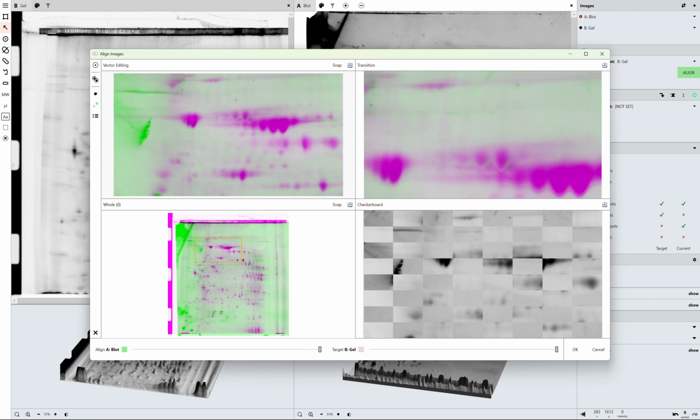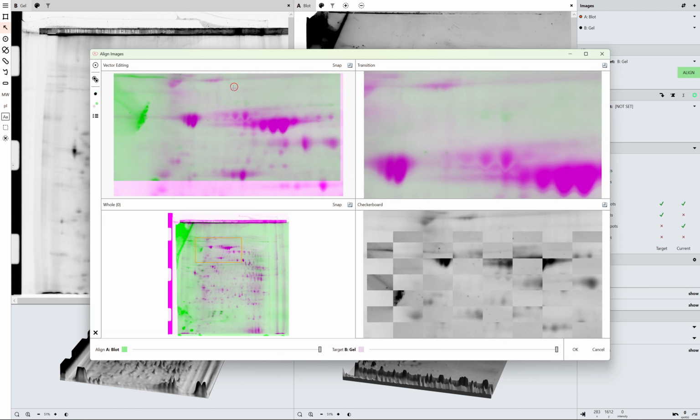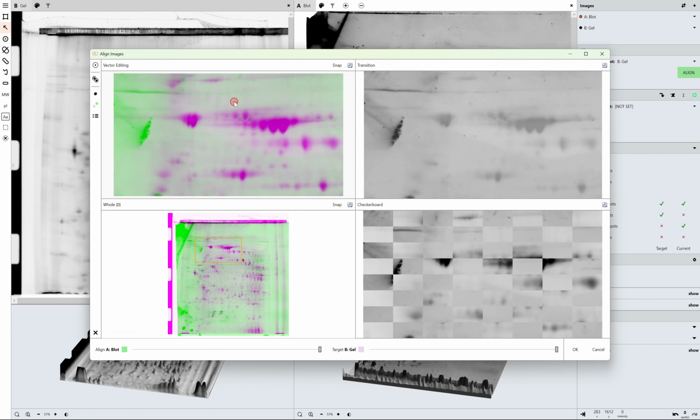I think we may have already aligned. There we go. So it's probably going to be really hard to see, but we can see on the green level, these sections just drop into these spots here. But I had actually already aligned. By aligning the 2 points at the bottom, I had aligned the section at the top that I was going to look at.